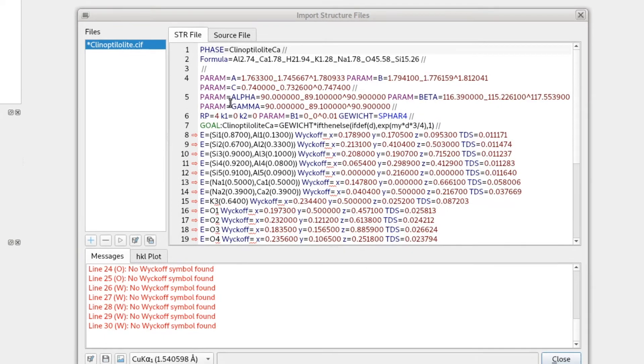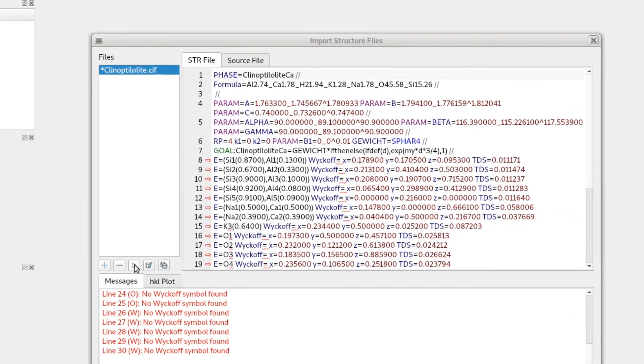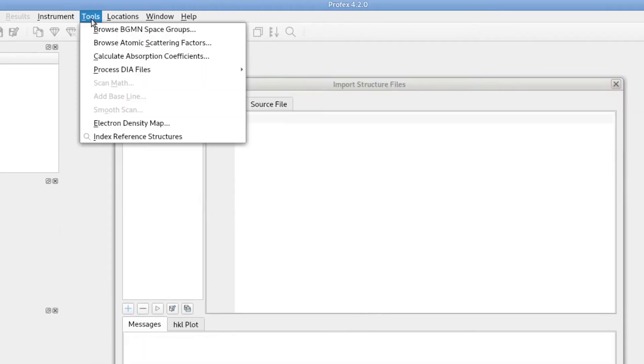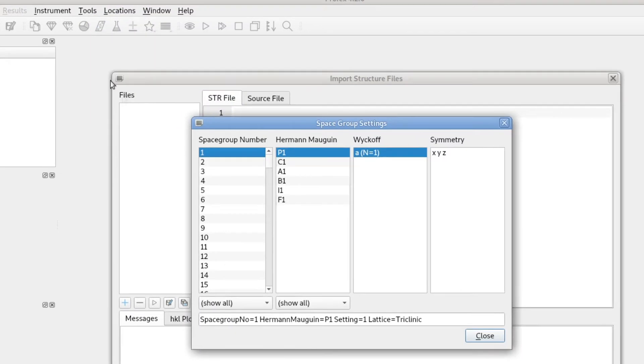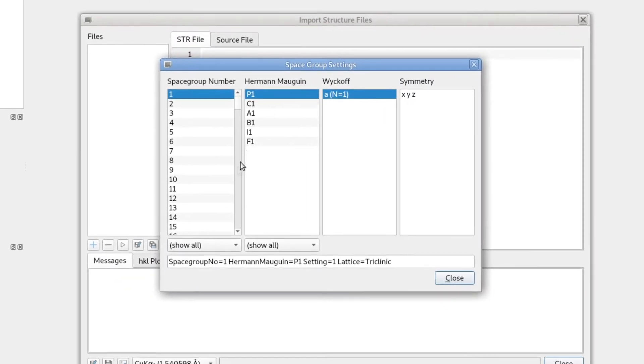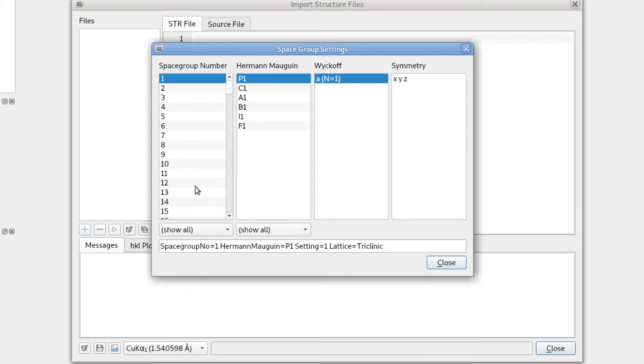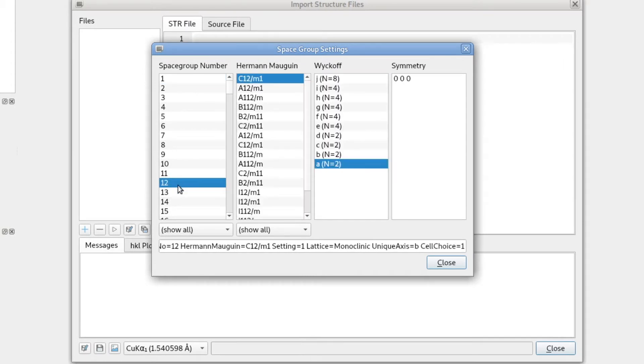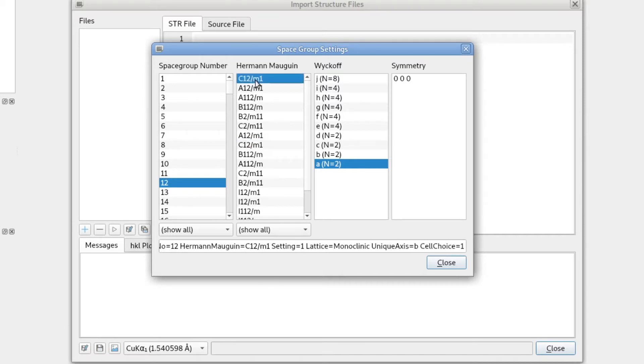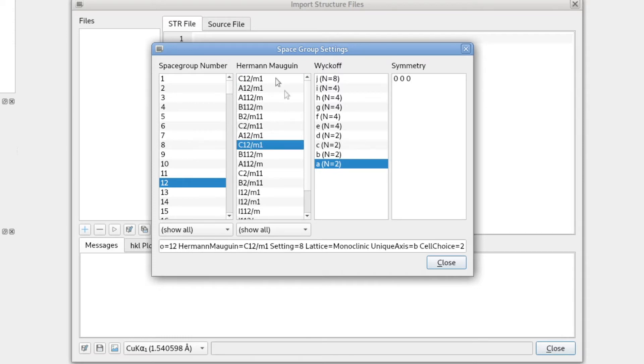And the problem with this CIF file is that it does not contain Wyckoff symbols for the atomic positions. I will cancel this. And let me show you in Tools > Browse BGMN Space Groups. We can have a look at all the space groups known by BGMN. So we were in number 12. And in the next column we have the different settings, and we have to decide between setting number 1 and setting number 8. So they both have the same Hermann-Mauguin symbol.